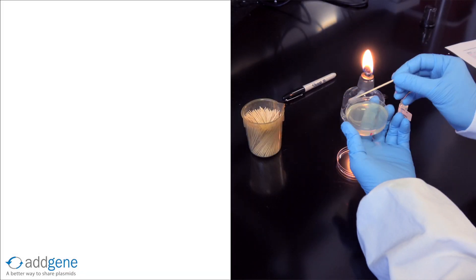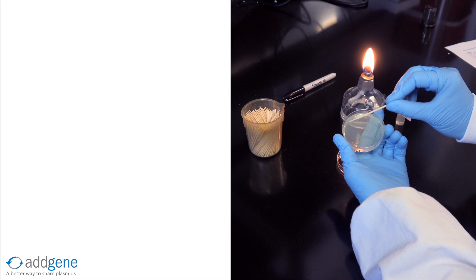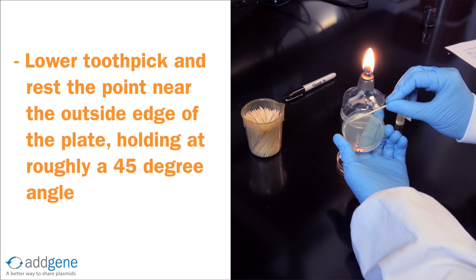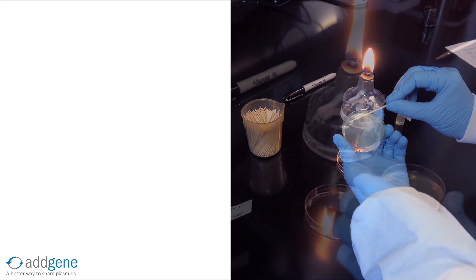With the tip of the toothpick now covered in bacteria, we can begin streaking. We lower the toothpick and gently rest the point near the outside edge of the agar plate, holding the toothpick at roughly a 45 degree angle.